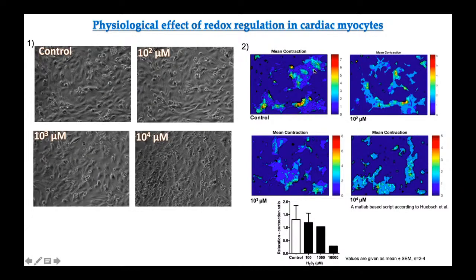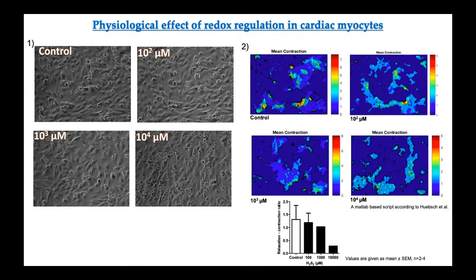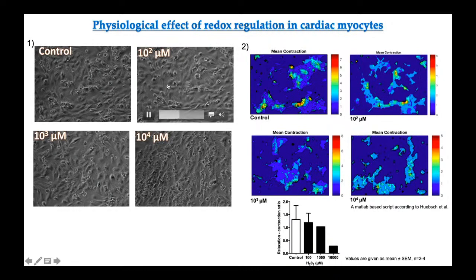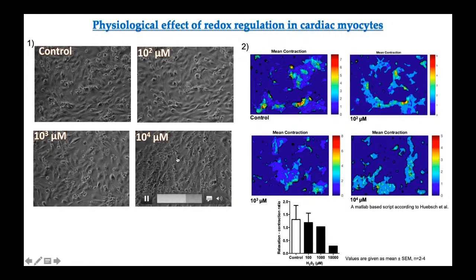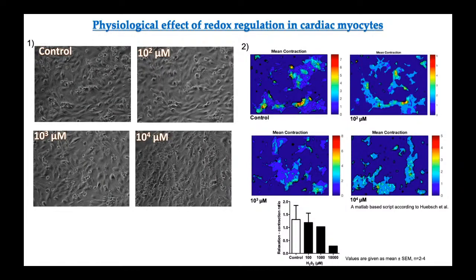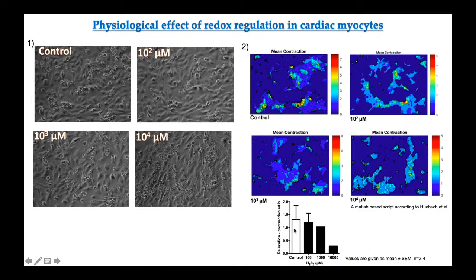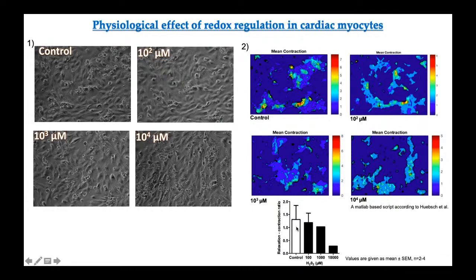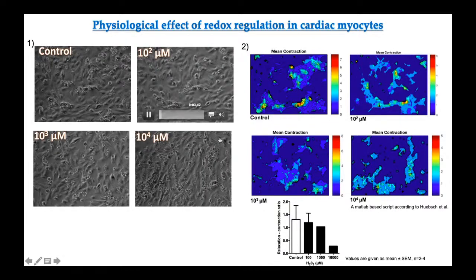And on the right hand side, it's MATLAB software. This is also very important if somebody is into research already. Nobody accepts these results. Nobody wants to see this actually. In research, nobody cares what you see. You have to represent that figure in a graph. What do you see in a quantitative or qualitative way? What differences do you see?